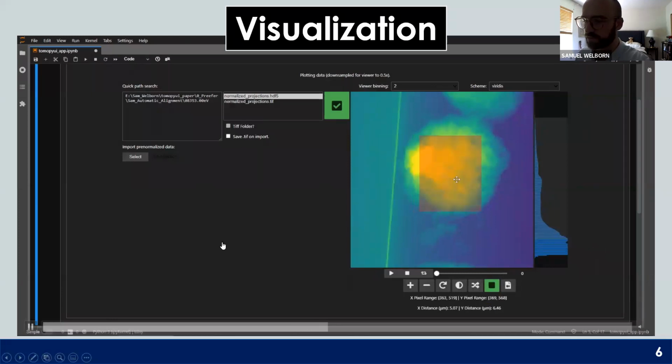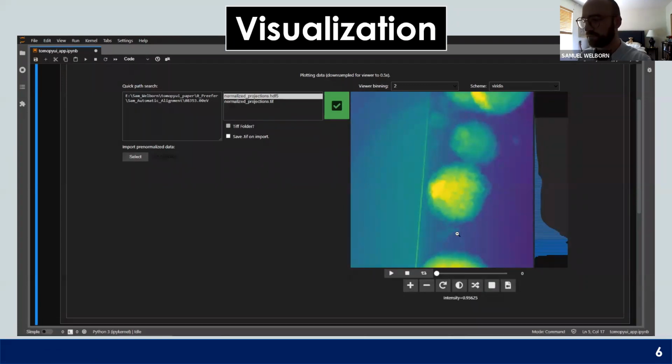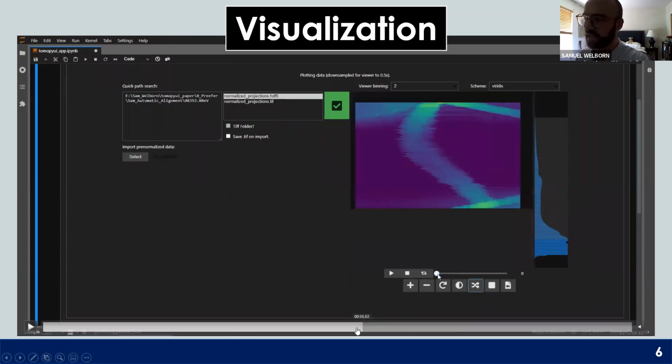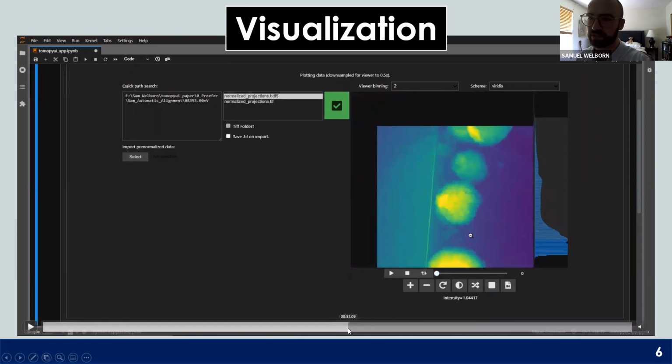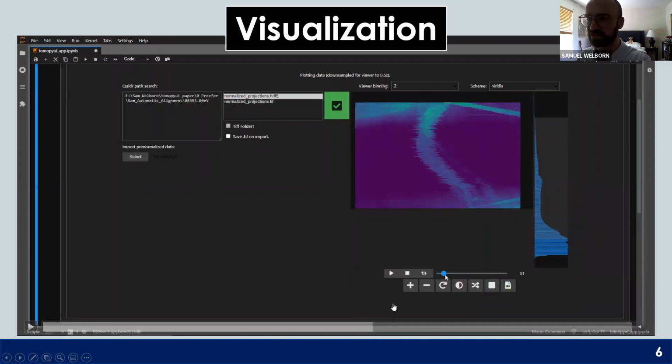There is this problem with Jupyter notebooks where the widgets, there's a relay between the front end and the Python kernel that causes lag sometimes when you're sliding through this type of data. And so if you wanted to really quickly slide through this data, that's going to be key, because you don't want to have lag when you're trying to find the center of rotation, which I'll show you in a minute. There's also other tools to quickly view the sinograms of the data.